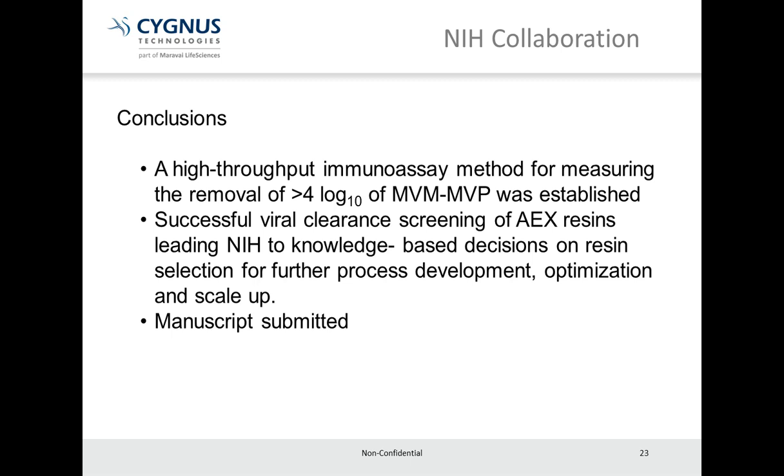So the data from this study was also repeated with an Anion Exchange battery of resins, and we also tested some membrane absorbers as well. The data from this study is being submitted for publication, and we're excited for that to come out because we'll reveal what these different resins were when that data comes out.